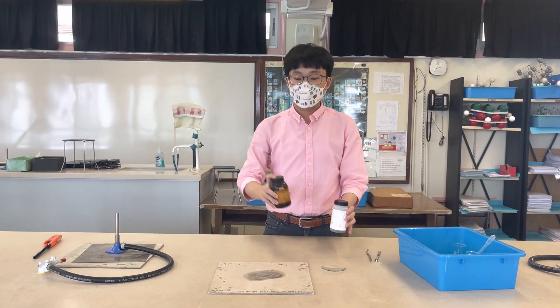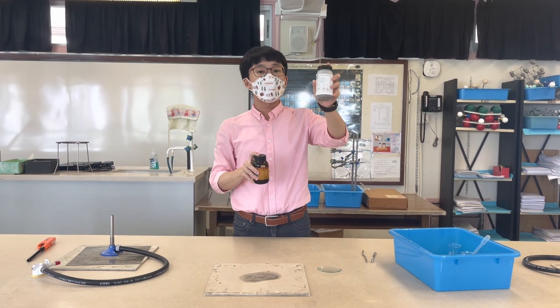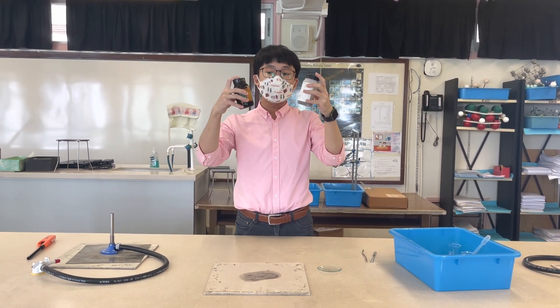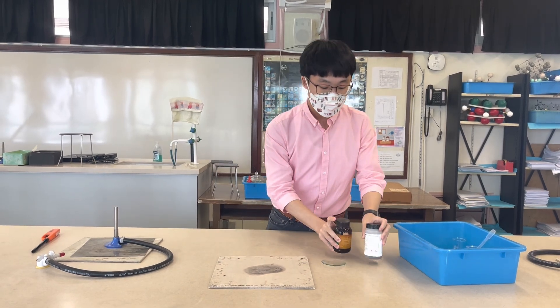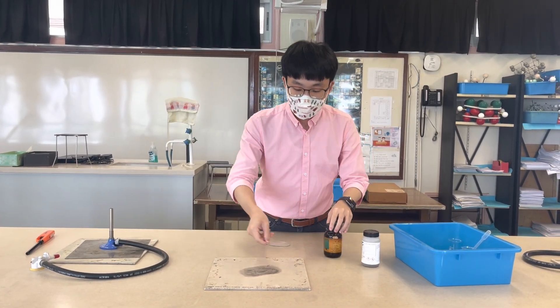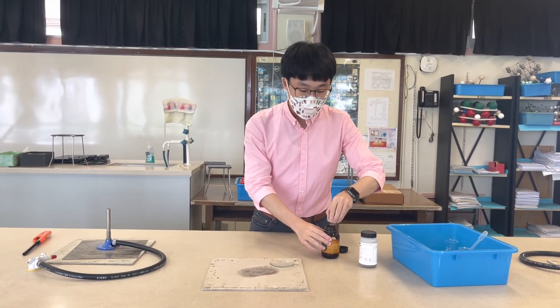Today we are going to perform an experiment on the displacement reaction between zinc powder and copper(II) oxide. We have these two powders here, both in solid state, and right now I'm going to mix these two on a watch glass.